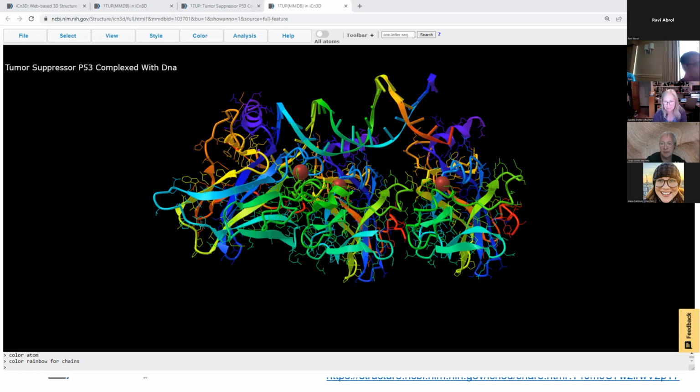It's awesome. That's a great point. Looking at parallel versus anti-parallel or mixed structures is pretty good for rainbow coloring. I did work with G-quadruplexes, and that kind of stuff was really important to understand how the core worked.